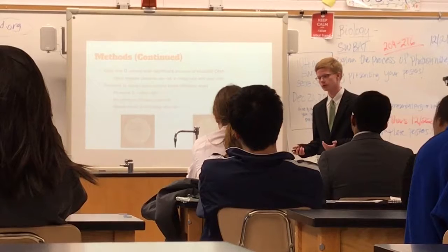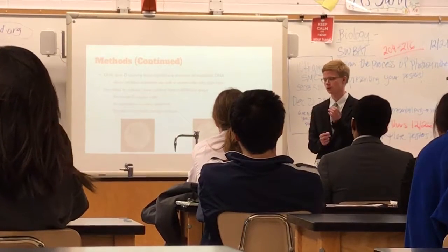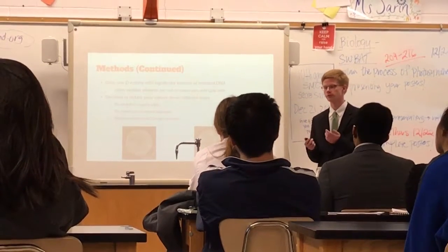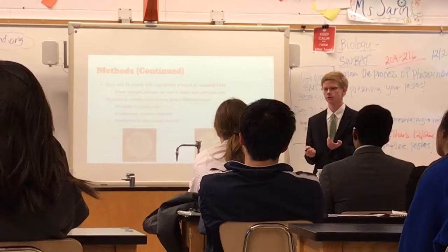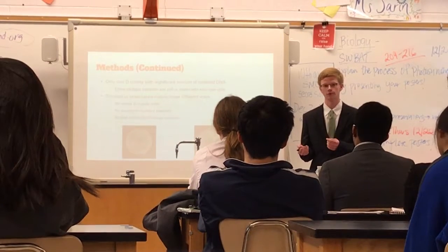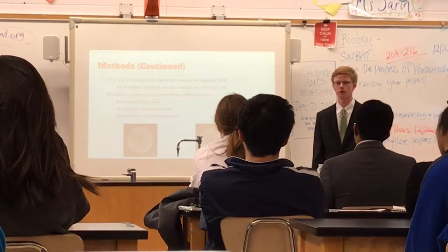But there was a problem here too, because there was a mix: around 60% of the mutated DNA and around 40% of the unmutated template strands. So obviously what happened is that the DpnI I added later did not get rid of all of this template, which is a problem, and it shouldn't have happened, so something must have gone wrong in the mixing process.